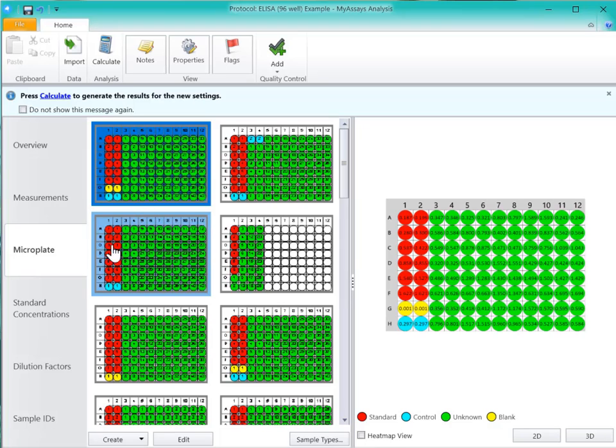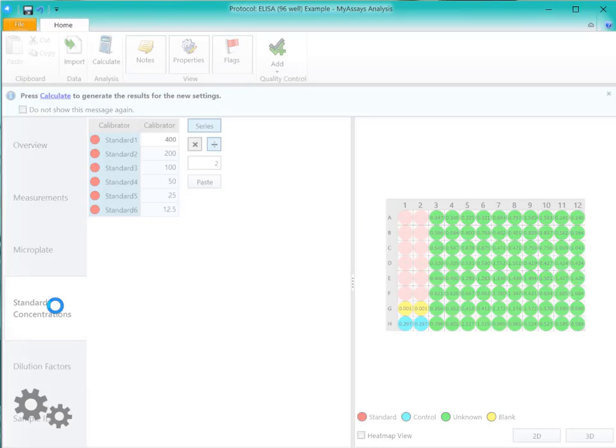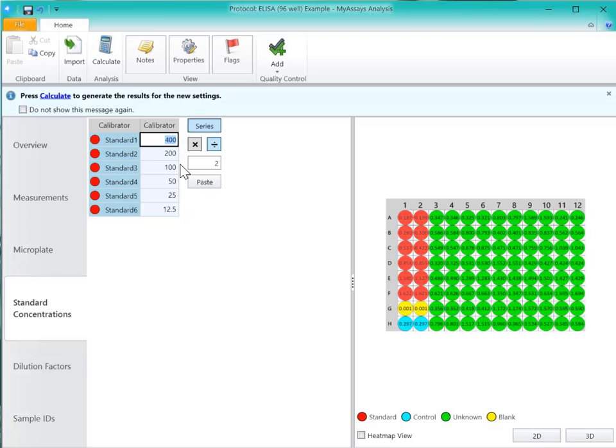Next, we can use the Standard Concentrations tab to specify our standard concentrations value. I'll enter 500 as my first calibrator and allow the series to fill the rest of the calibrator values by dividing by a factor of 2.